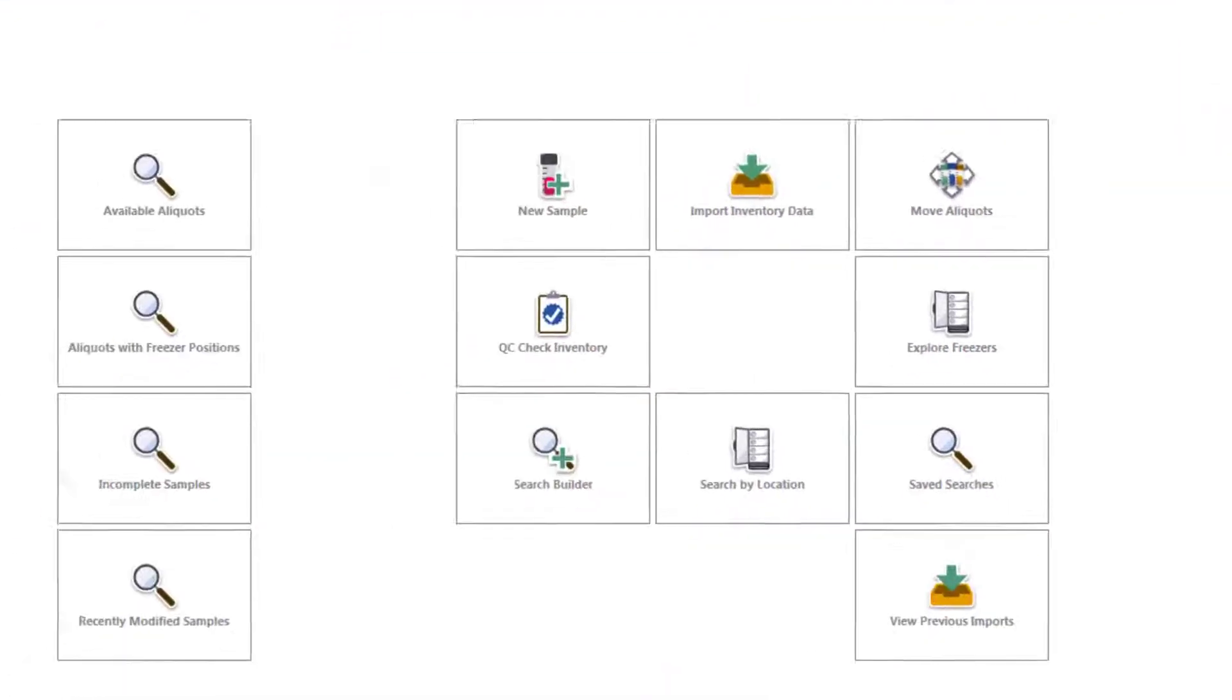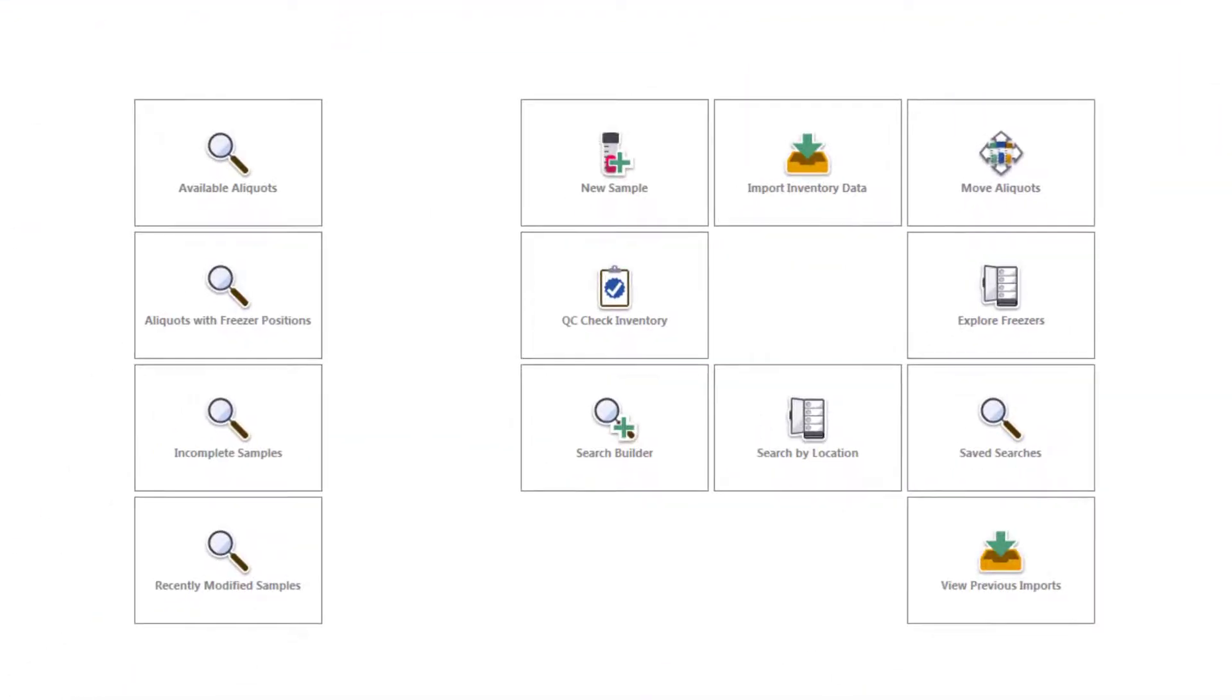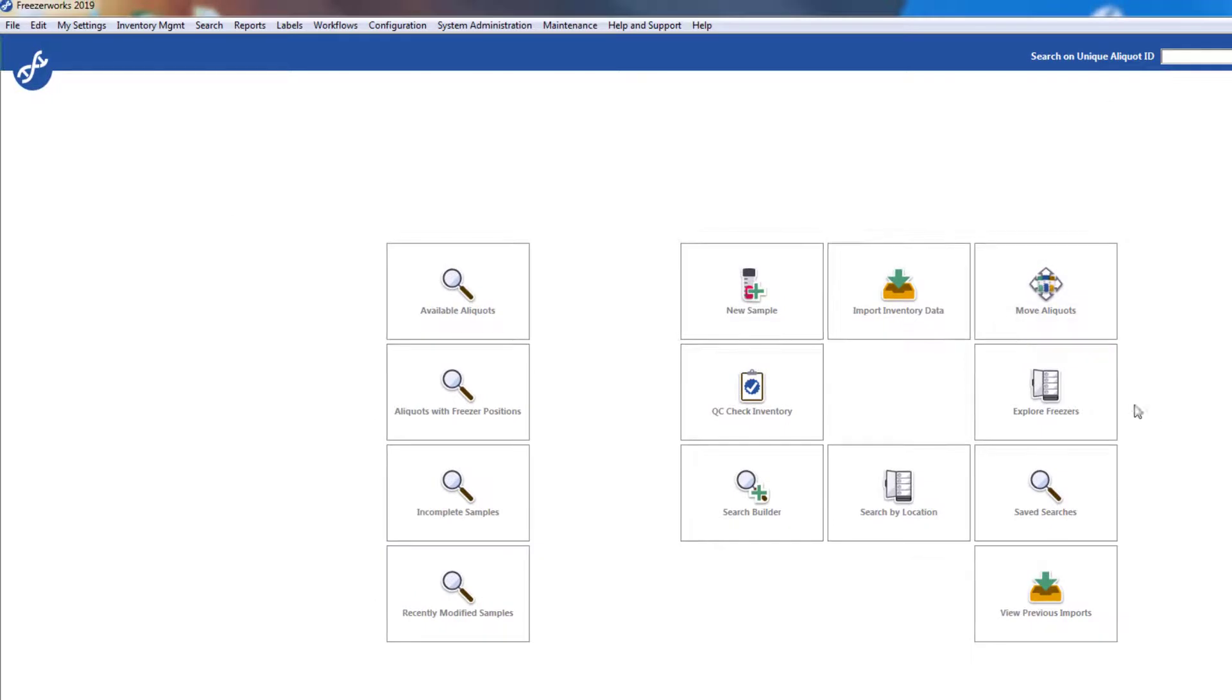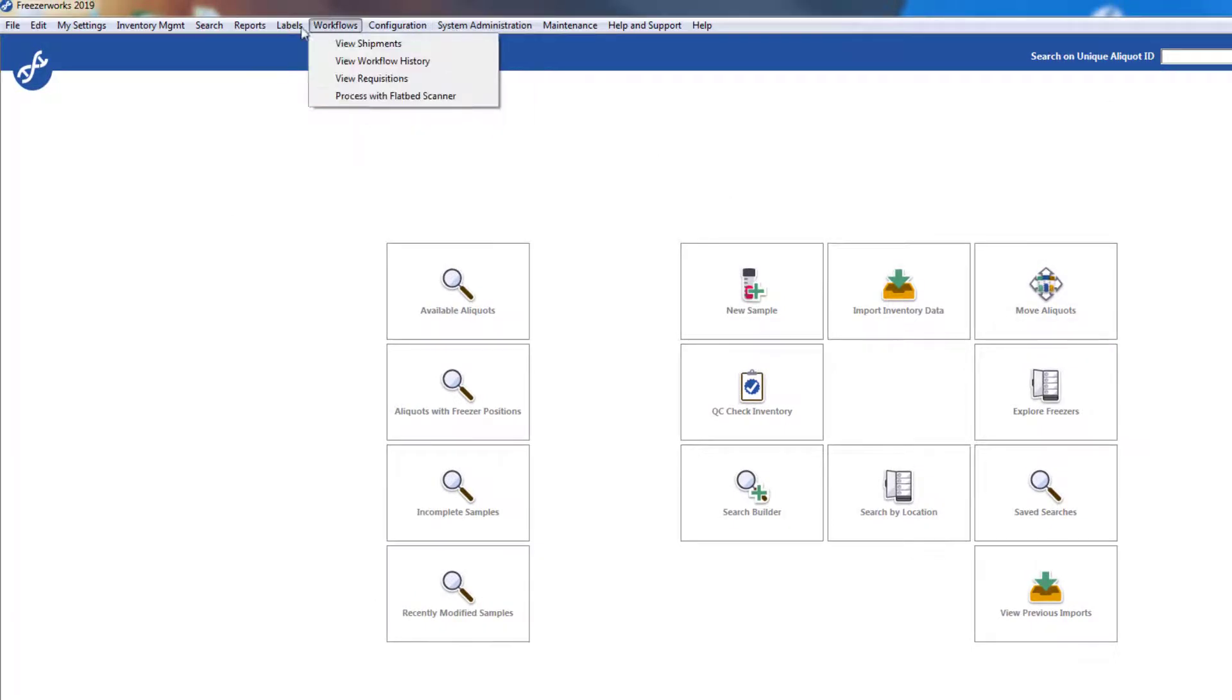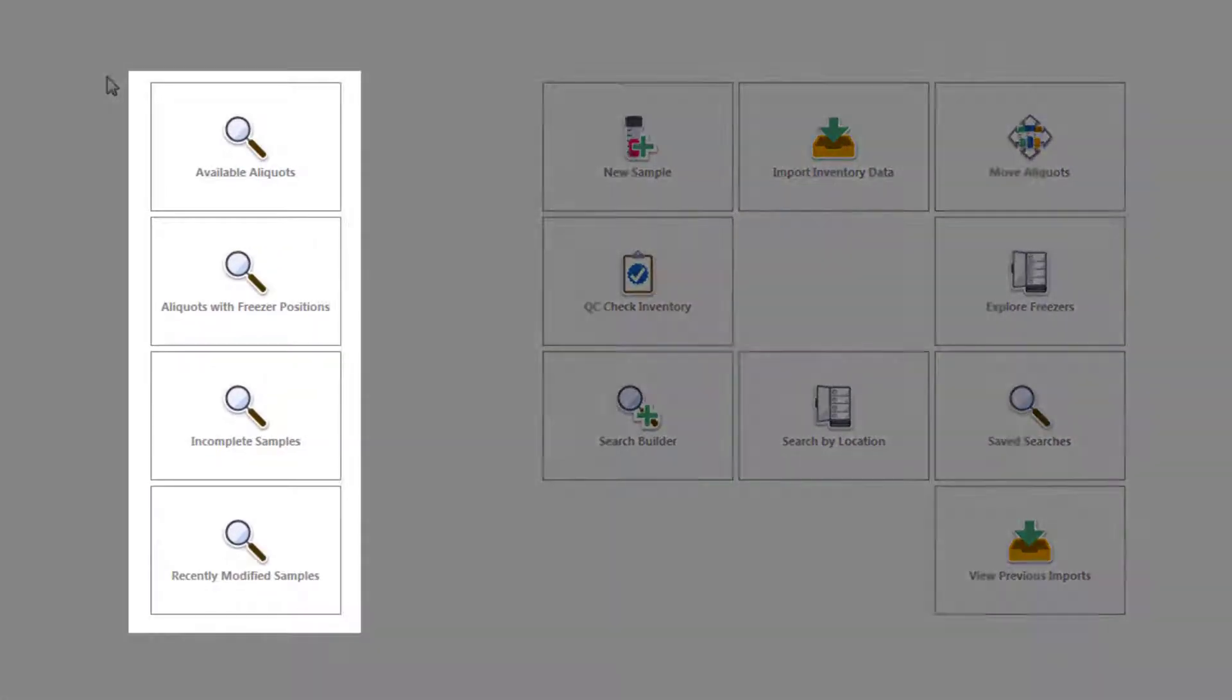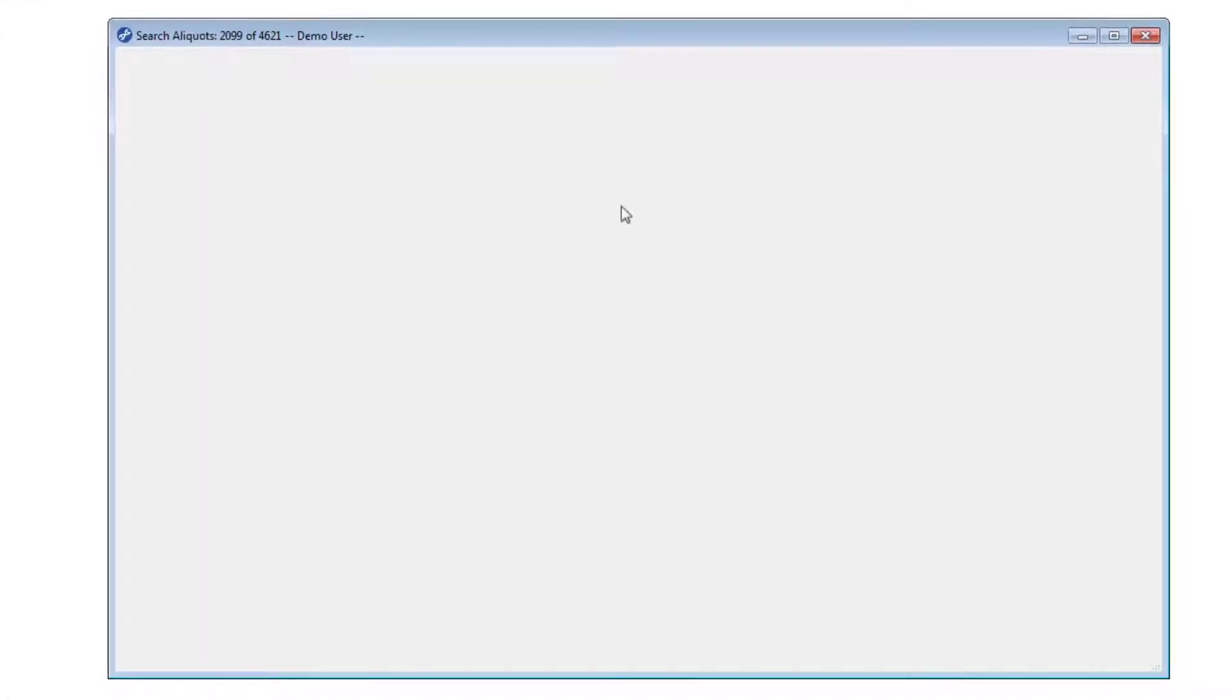In the center, the tiles that make up the body of the homepage will take you to various places in the program. When properly configured, these tiles move you through the program much faster than the menus at the top. On the left are some searches that we've created so that you can see how FreezaWorks displays data.